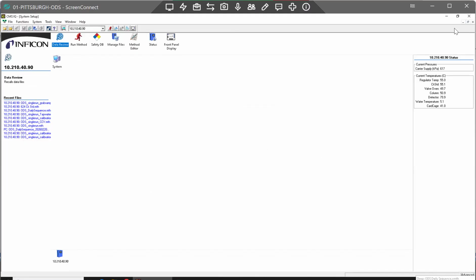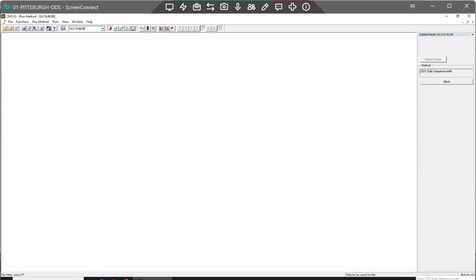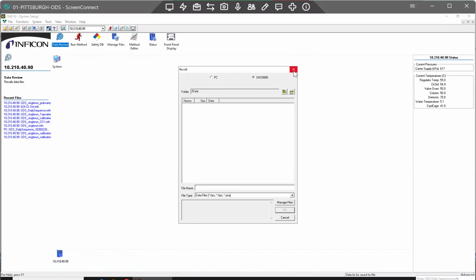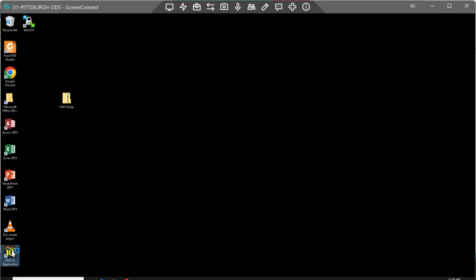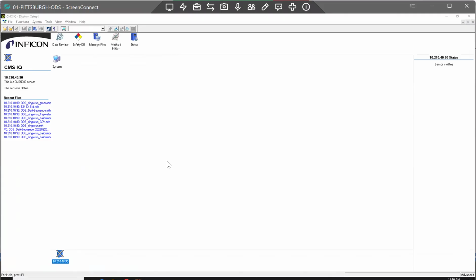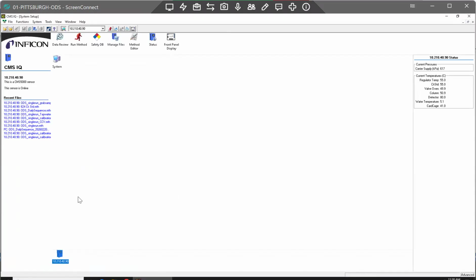Where'd it go? Okay, where is it? Oh no. Okay, we glitched. Let's out this. Okay, try this one more time. All right. It's going to run in a minute and 2 minutes. Actually, I'm just going to abort that because I want to make sure it actually took the calibration. So anyway, I'm just going to run method.